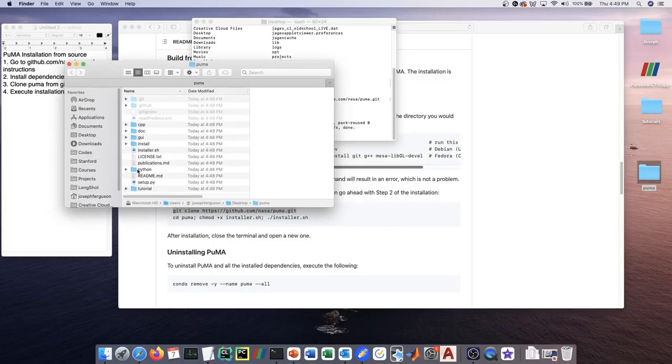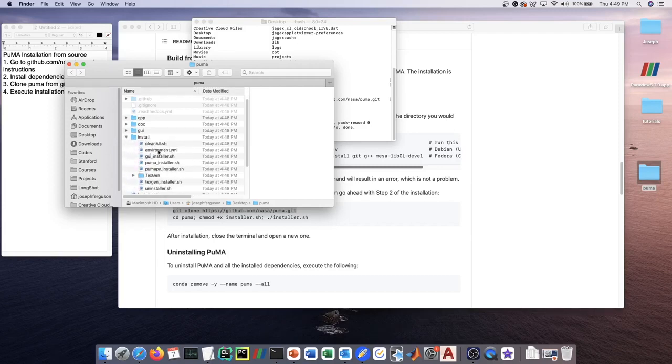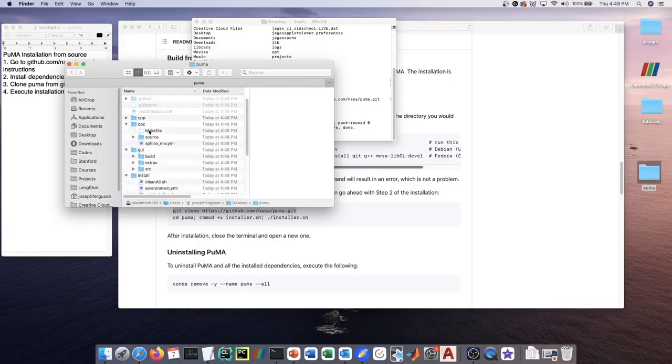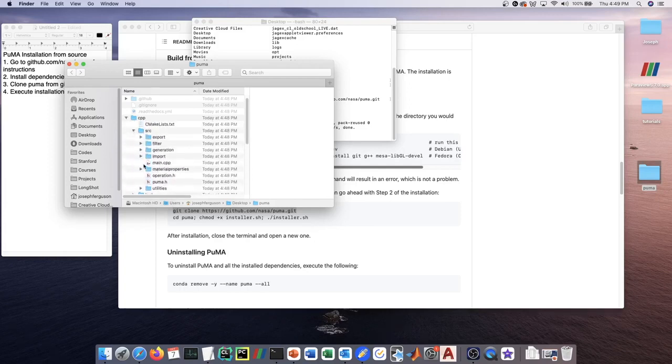There's the readme of course, the Python source code, the installation scripts, the GUI source code, the Doxygen and Sphinx stuff for compiling the documentation, as well as the C++ source code, and tutorials at the bottom.